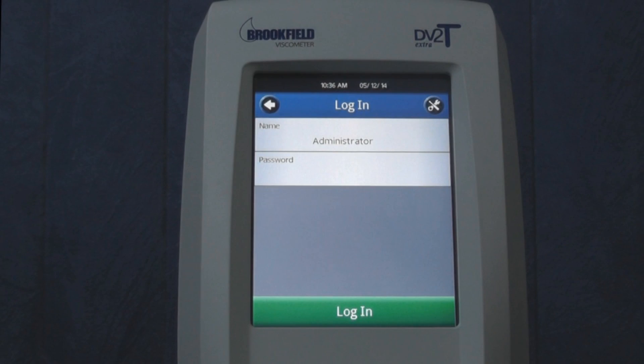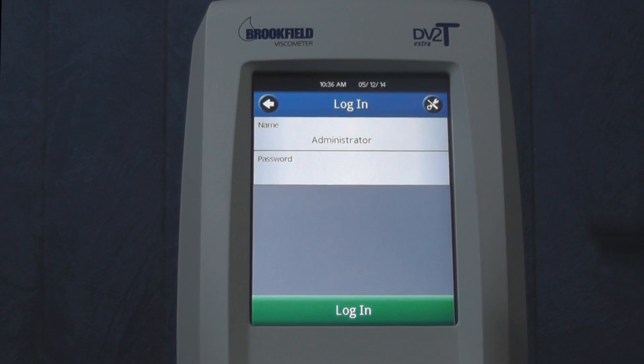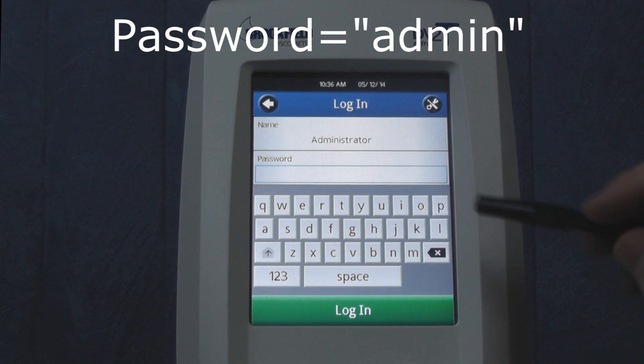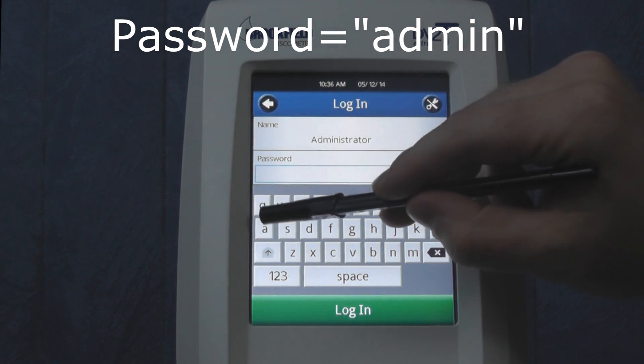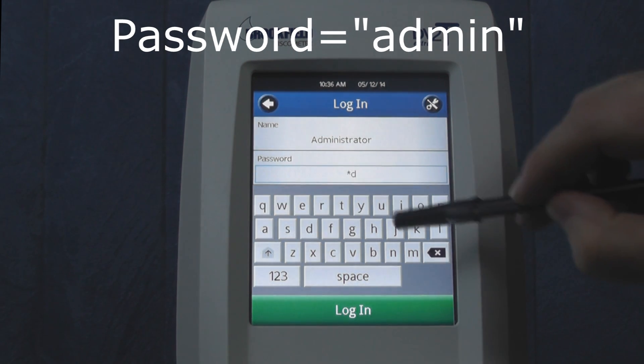The Administrator is the main user and is the only one initially programmed into the instrument. When logged in as the Administrator, you will be able to set up different users, control what they can access or edit, and turn on or off this login requirement. The universal password for the Administrator is "admin" in all lowercase letters.